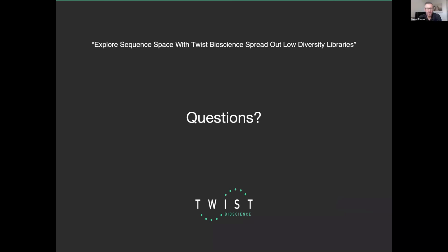Here's another question about turnaround time. Is there a limit to residue position and substitutions per position? You sort of answered that. It's design dependent. We've had folks submit library designs that have 10 to the 81 variants in them. So you could submit whatever you want, and we'll likely be able to find a solution. Tell us what your dream library is, and our team will work with you to figure out what we can actually do.